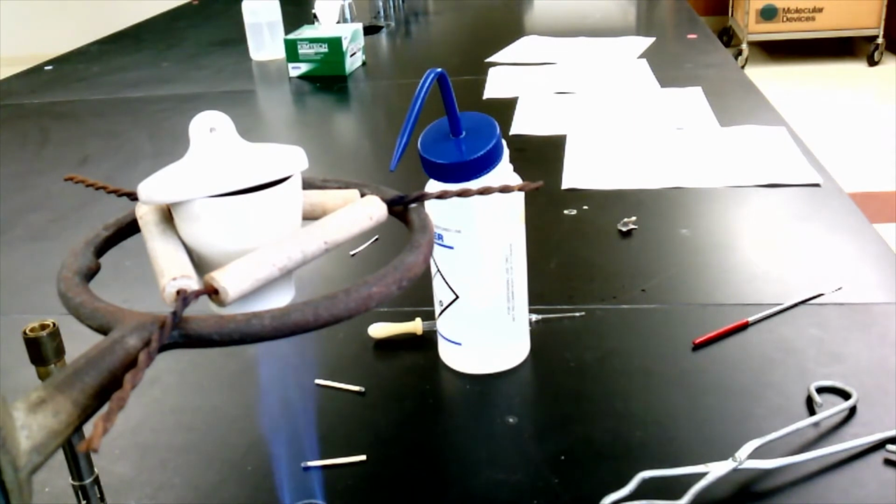Now let's see what's going on in procedure A over here. Let's see what we got with procedure A. Well, you would have been able to see it, but I just ruined it because I moved the watch glass, so we're not going to see that yet. We're going to wait. But we'll see it soon. Okay, so when we come back, we're going to look at our magnesium oxide, and then we're going to get the mass of it. Okay, so I'm going to let this heat gently for a few minutes. I'm going to heat it strongly for a few minutes to drive off all that water.